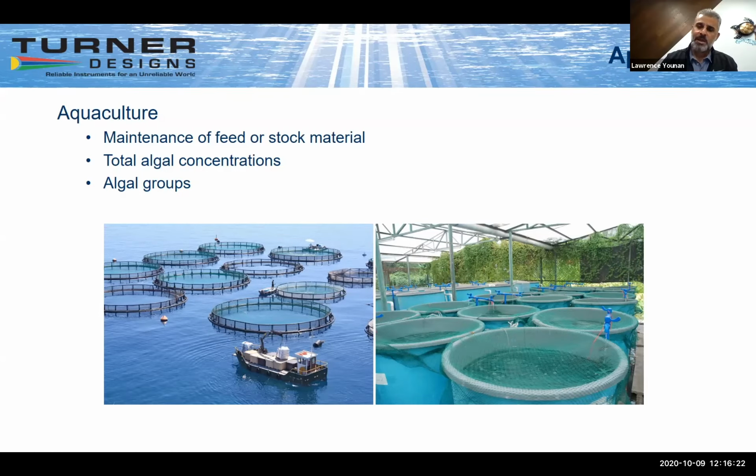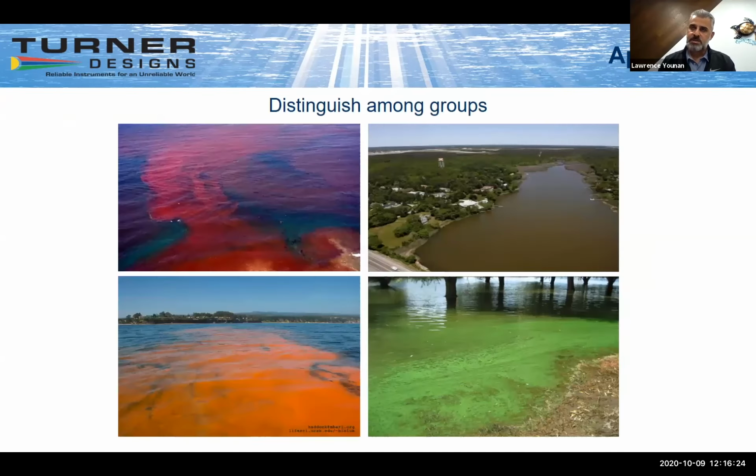So really being in the water is a lot better than taking water out. And that's the purpose of this kind of development Characterized is working towards, is getting instruments into the water, getting people to go put instruments into the water versus our traditional benchtop take away from the environment and read. And of course, the better we become at picking out those specific marker pigments, the better we can distinguish among groups out there in real time.